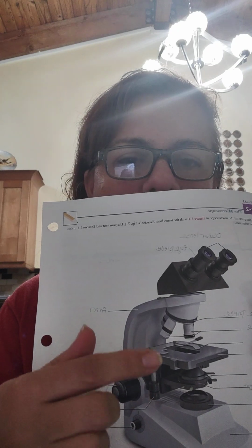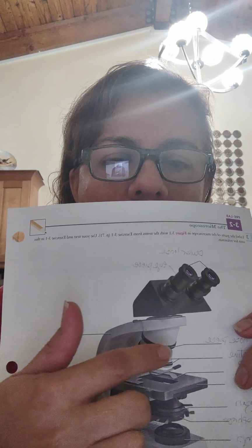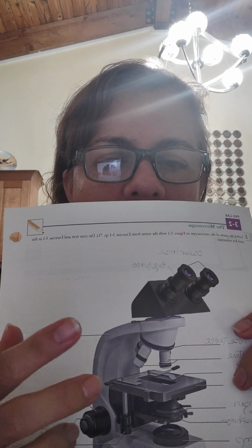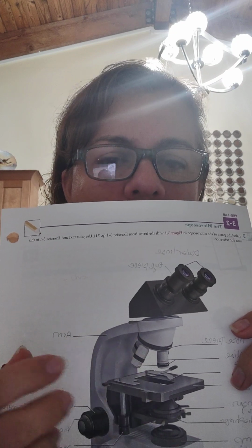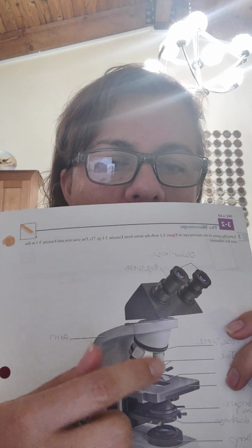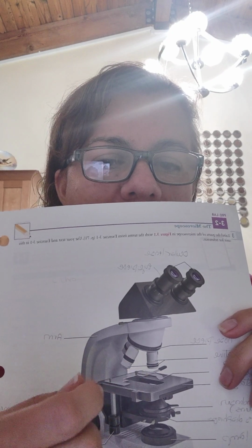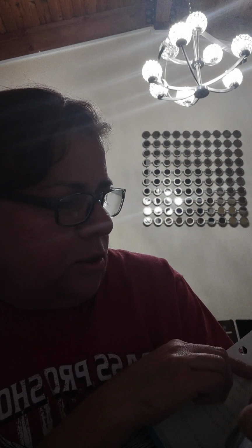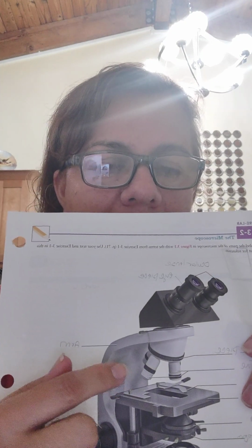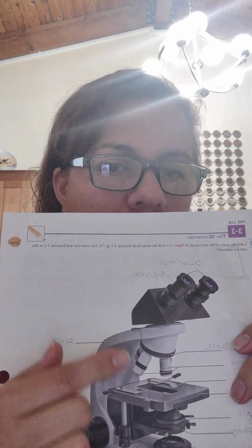Okay, so what are we missing? Oh, now I'm going to talk about the objective lenses. The objective lenses sit on the nose piece. So the first one would be the red, which is the 4X. First I'm going to mention all of them, and then I'm going to talk about the magnification. Then the next one is the yellow, which is the 10X. And the one after that is the blue, which is 40. And the final one is the white, which is 100.